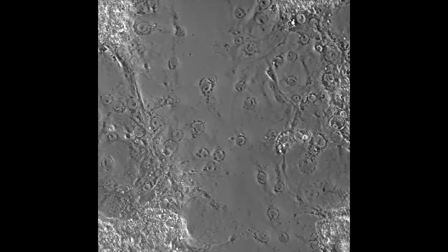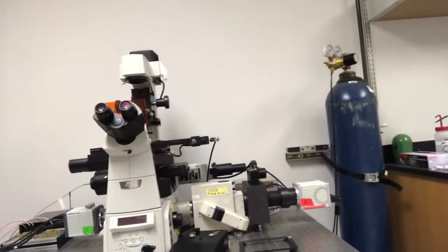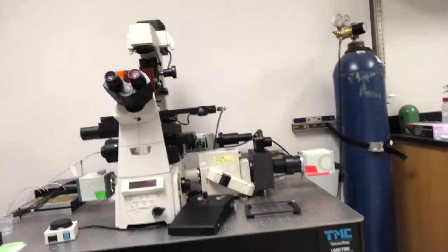I have a motorized stage and a couple of other bells and whistles that really make it useful for the type of research that we do. If some of that did not make sense to you, that's completely fine — you should take my cell biology class in the fall.